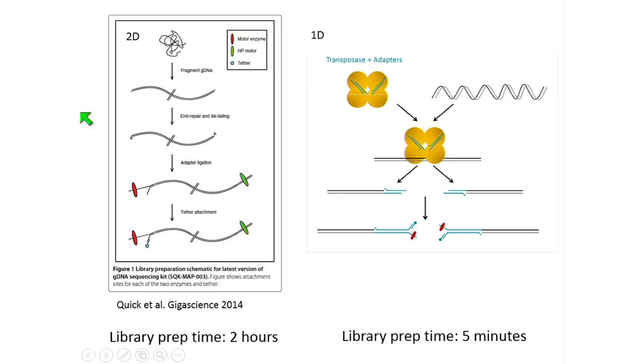It is genuinely true that the length of the reads that come off the instrument is really limited by your ability to do that sample prep and also the physical constraints of having DNA in solution. If you do try to have very, very long DNA, hundreds of kilobases, it will tend to shear and break as you pipette it through the library preparation step. But there's no theoretical basis for a limit of read length.